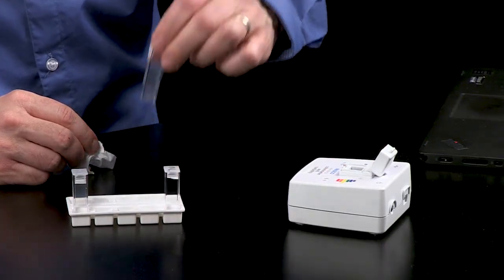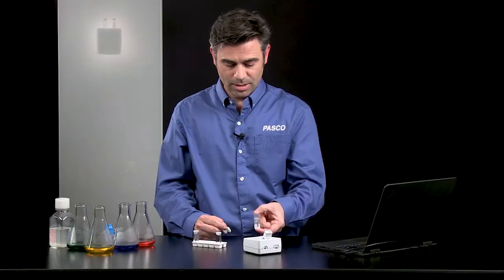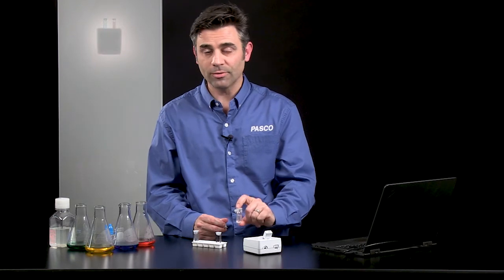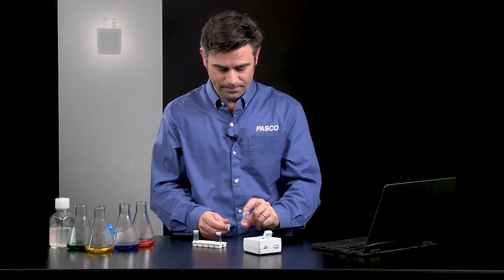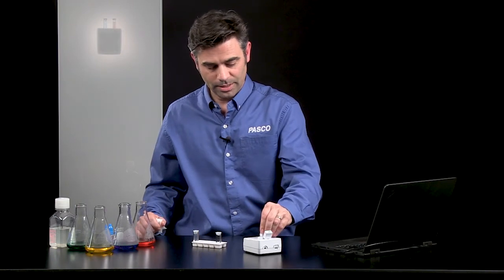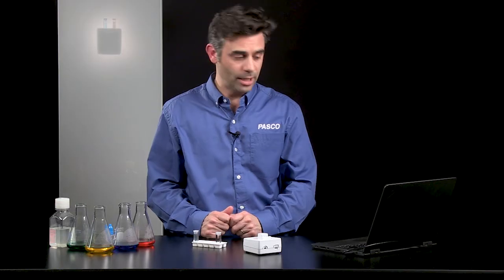I'm going to take my standard, my 100 NTU standard. I'm going to make sure it is mixed. There are instructions for mixing in the reference manual. I'm going to make sure the sides are clear. Put that in. And I'm going to calibrate. I get that check again, so I know calibration is complete.